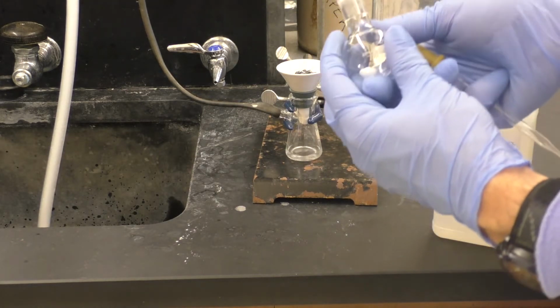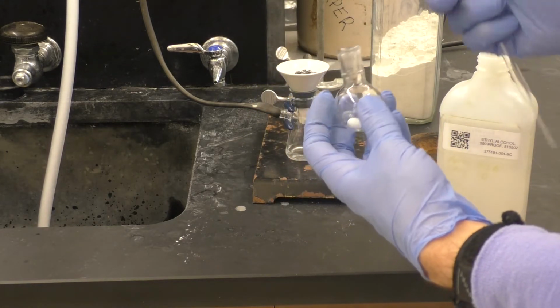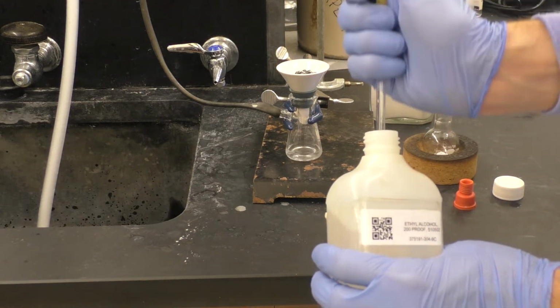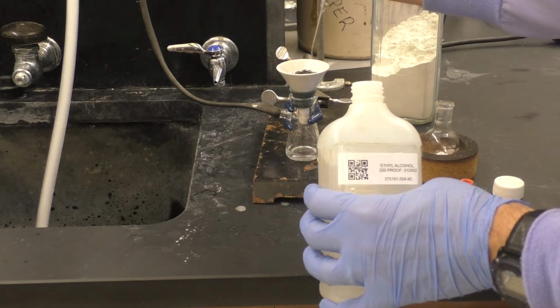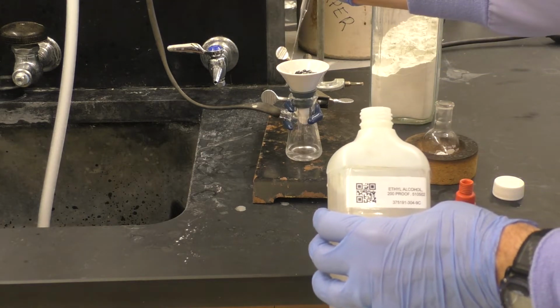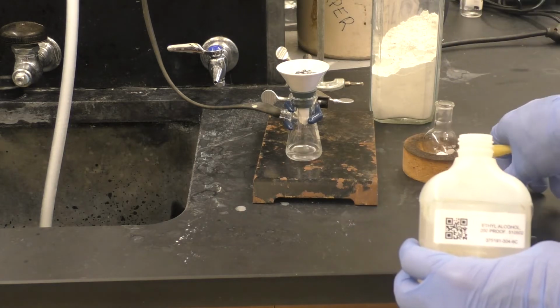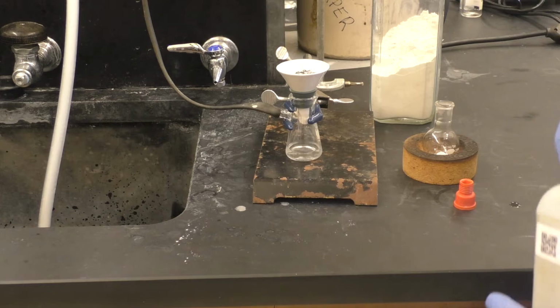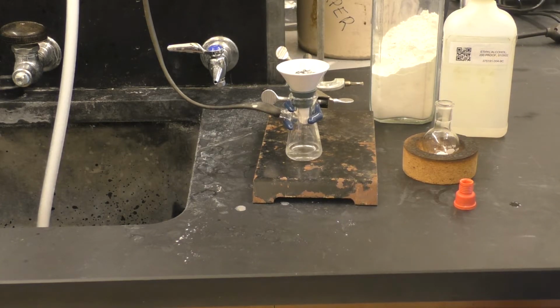Notice that the stir bar has remained behind, but I could have just allowed it to fall onto the Celite pad and then I would have just collected it later. Last thing is I'm going to rinse the pad of Celite directly. And now once that's done filtering, I should be good to take the filtrate and remove the solvent to leave me with, ideally, my pure product.